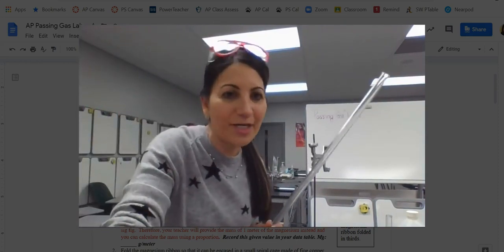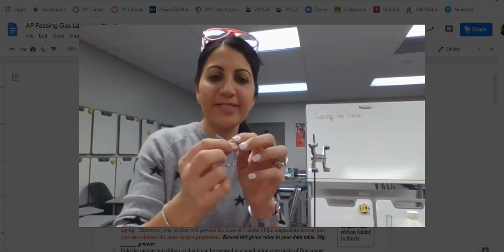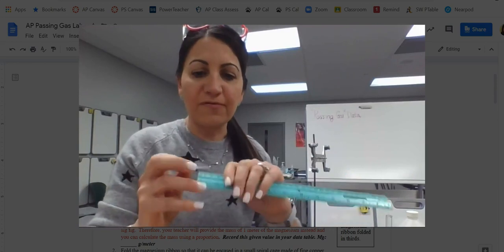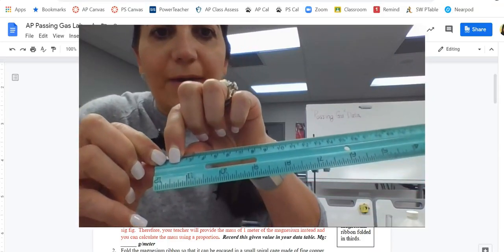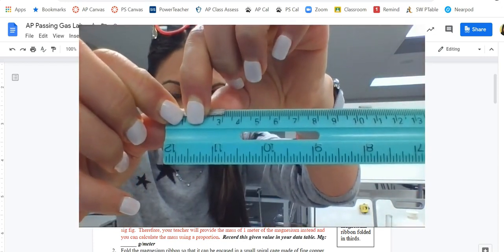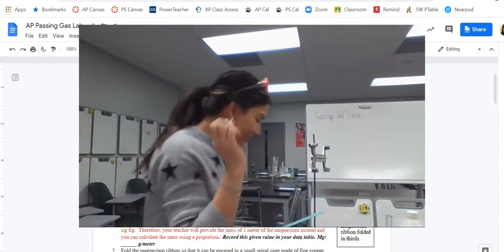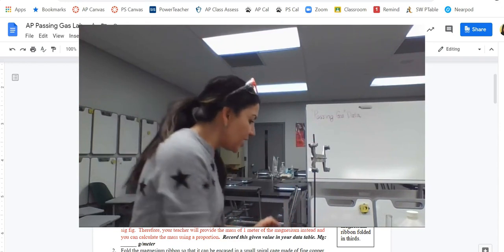So we've got the eudiometer. We also have, I wanted to show you a couple of things. I do have a 3 centimeter piece of magnesium, but I cut this out, and I want to get the exact number of centimeters here. Let me see if I can get you to see this here. Every time I try to do this, I shift it a little bit, but you're going to have to trust me on that. I'm at 3.10, and that's in centimeters, okay?